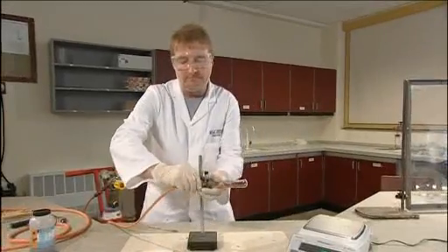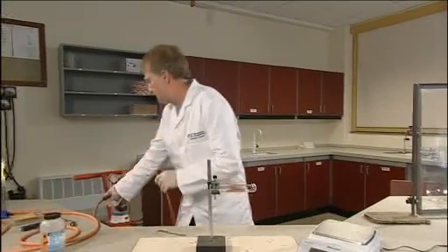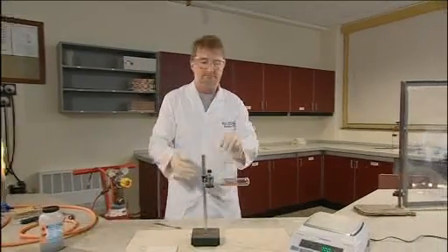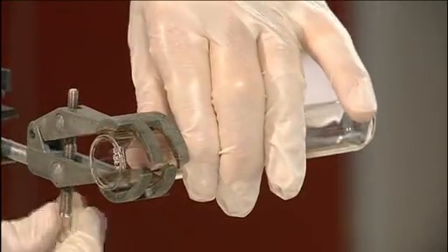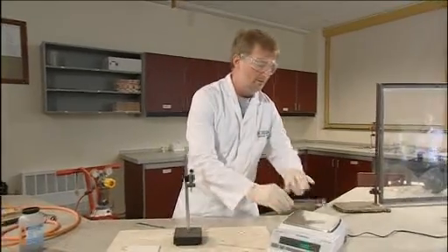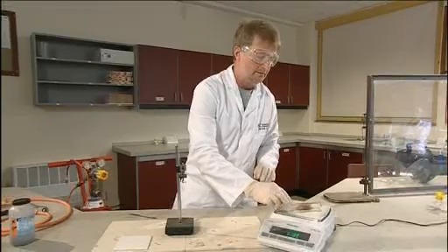We now blow out the flame. Remove the hydrogen delivery tube and turn off at the cylinder. And re-weigh the tube, which now contains copper.